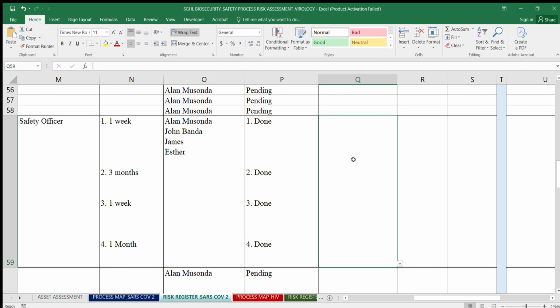All right, so now if everything is done by the time you're reviewing, it means that now you need to determine your likelihood and consequence. Now, if you've implemented everything and people are also not discarding these samples without autoclaving, you're looking at the practice from the time of implementation to the time of review.